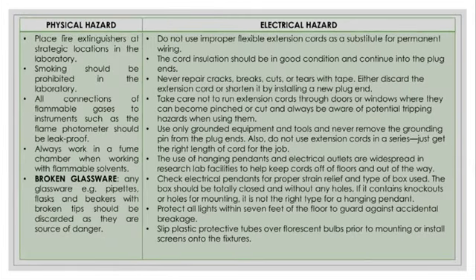Okay, for physical hazards, place fire extinguishers at strategic locations in the laboratory. Smoking should be prohibited in the laboratory. All connections of flammable gases to instruments, such as the flame photometer, should be leak-proof. Always work in the fume chamber when working with flammable solvents. Okay, for broken glassware, any glassware, pipettes, flasks, and beakers with a broken tip should be discarded as they are sources of danger.